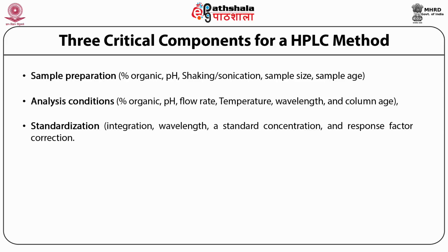Selectivity can be manipulated by combination of different factors like solvent composition, type of stationary phase, mobile phase, pH of buffers, etc. Changing the solvents and stationary phases are the most comfortable approaches to achieve the separation. The proper range of pH is an important tool for separation of ionizable compounds. Acidic compounds are retained at low pH while basic compounds are mostly retained at higher pH. The neutral compounds remain unaffected.